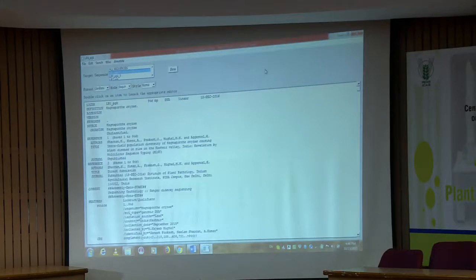Here, stepwise, we have added all the things like the organism name, the sample name, LB1. This was my first sample with this primer. You can see at the top, this is LB1 with PGK. If I scroll down, other samples are also there, but in my window I can see the samples one by one. So, I have to select it from the top and keep on checking all my entries. Now it will highlight how many bases are ready for submission, right.